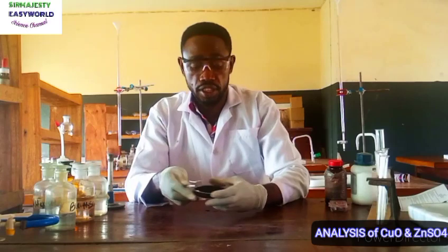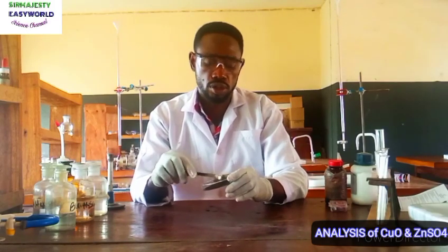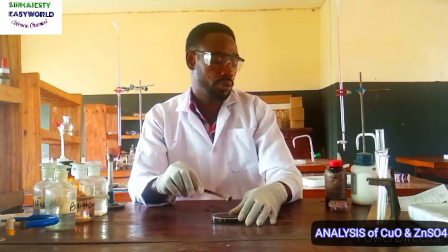Okay, this is the final thing we have in the mixture of the two salts. Remember, this is the unknown sample.